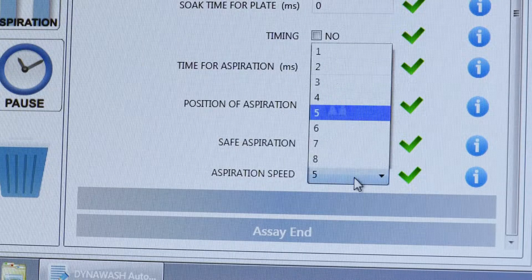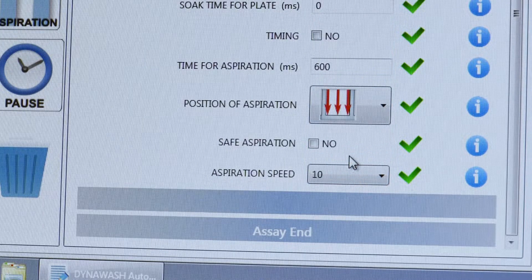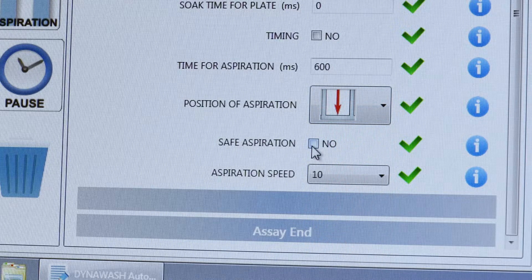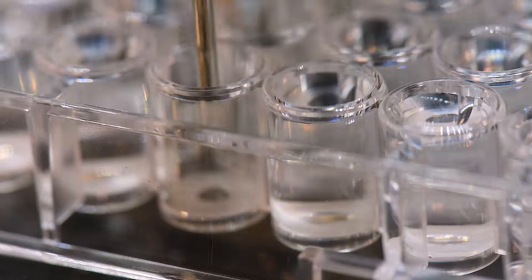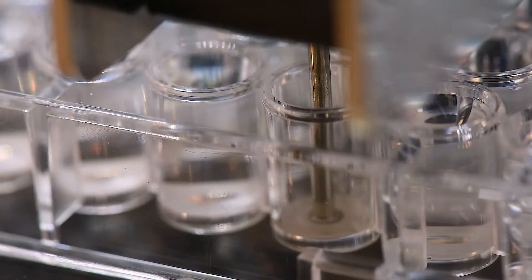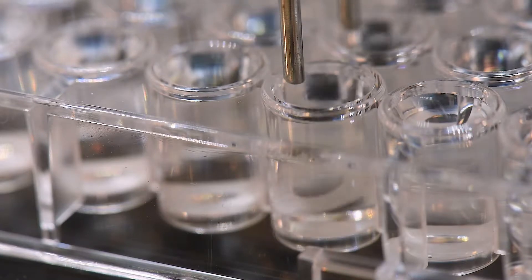It has many options for setting washing parameters, such as adjusting the aspirating speed, multipoint aspiration to reduce residual volume. Also, safe aspiration function is possible, for example, when washing wells with discs so that they don't wash away.